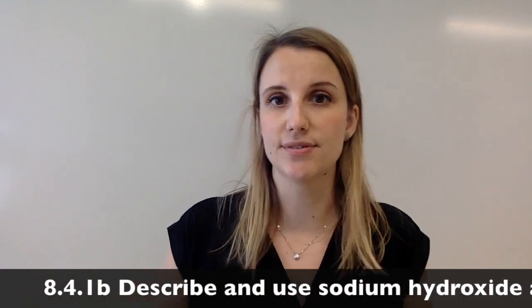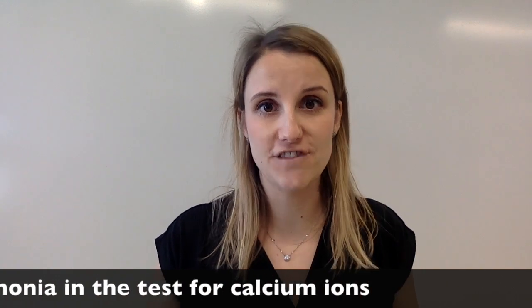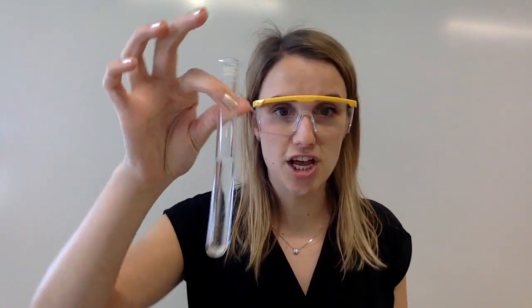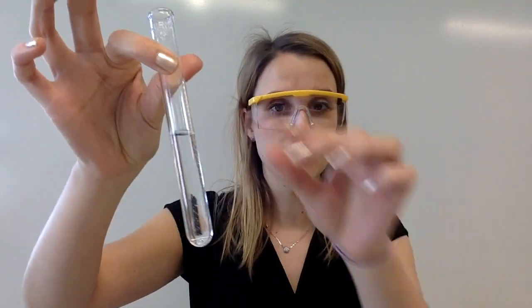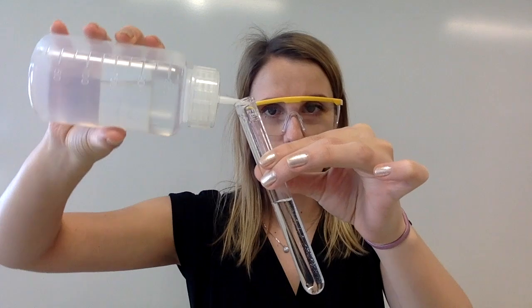So this video is about the test for calcium ions, that's Ca2+. So let's have a look at the experiment first today. The first thing that I've got is a solution that contains some calcium 2+ ions, and to this I'm going to add some sodium hydroxide.